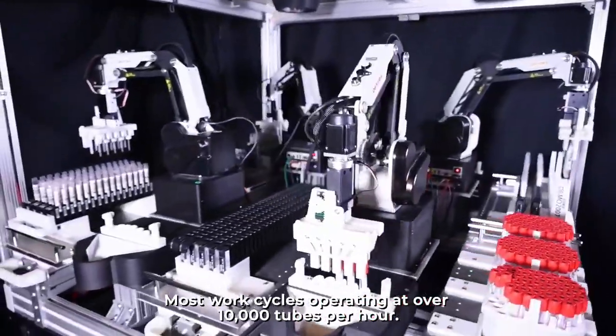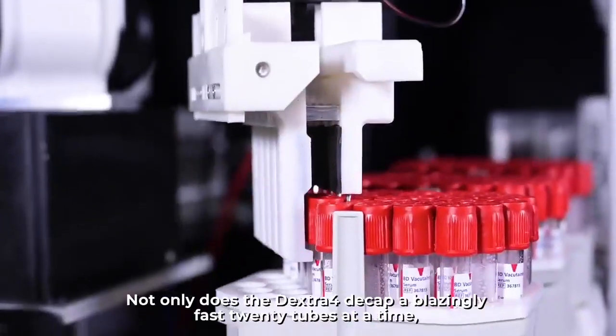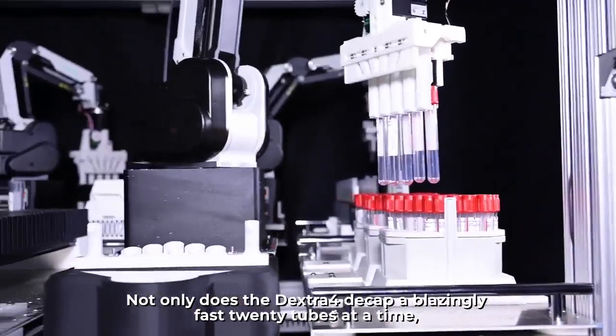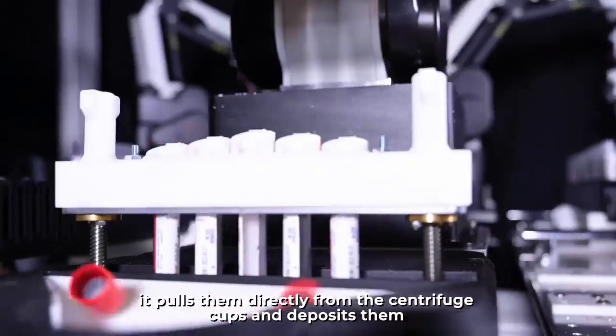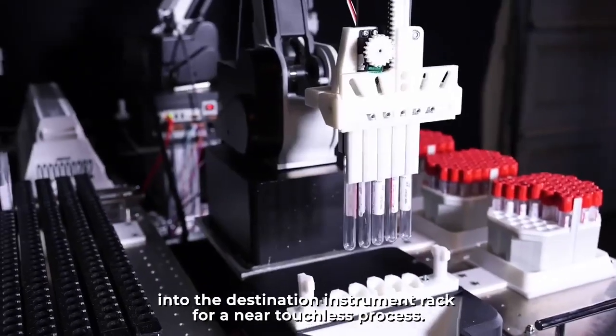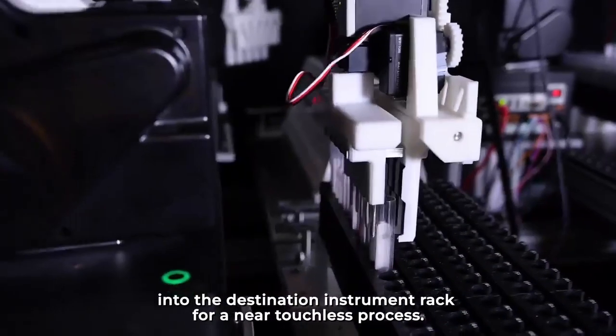Most work cycles operate at over 10,000 tubes per hour. Not only does the Dextra4 decap at a blazingly fast 20 tubes at a time, it pulls them directly from the centrifuge cups and deposits them into the destination instrument rack for a near-touchless process.